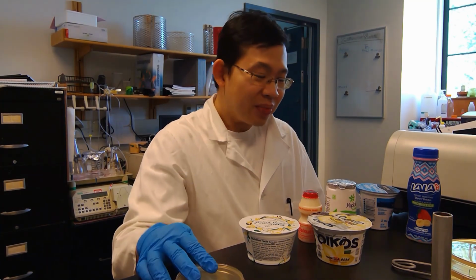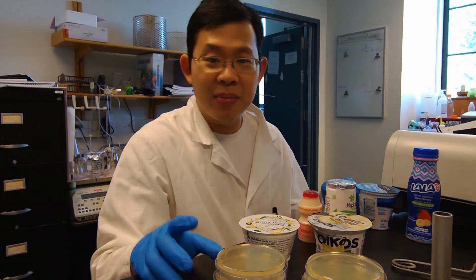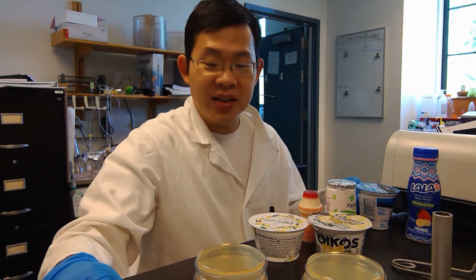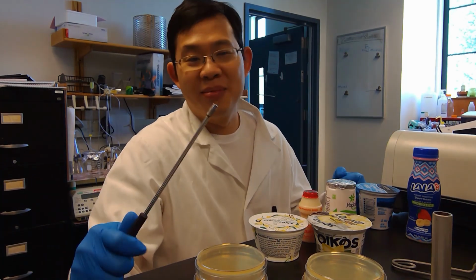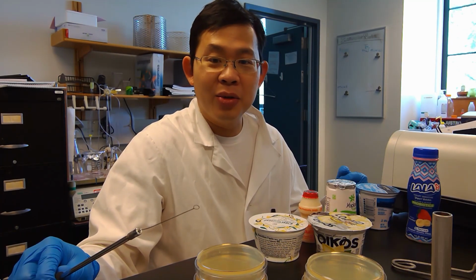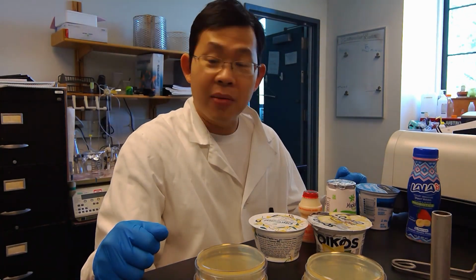Okay, so to begin with, I have with me several bacterial standard nutrient agar plates that you can find in a microbiology lab, and the probiotic products over there. I also have arguably the most useful tool in microbiology lab, which is the inoculating loop, and this is what we are going to use to perform the streak isolation. As usual, we have the Bunsen burner, and I think we are ready for it.